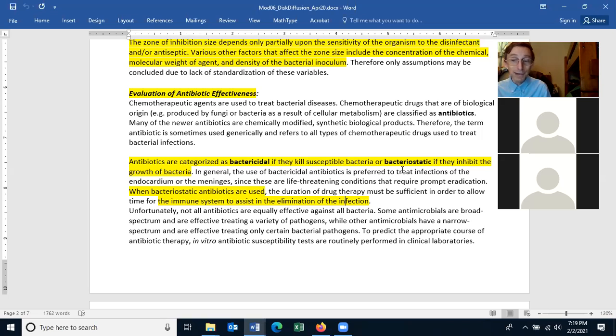They'll still be there and you can see them. Now, maybe after a day or two, the bacteria will slowly disappear because they'll start disintegrating. But I don't think anyone wants to be looking under the microscope for over a day.